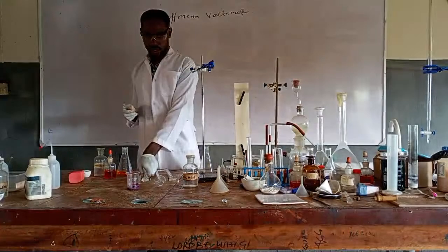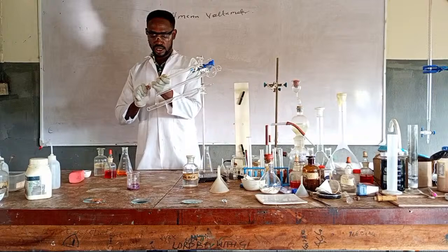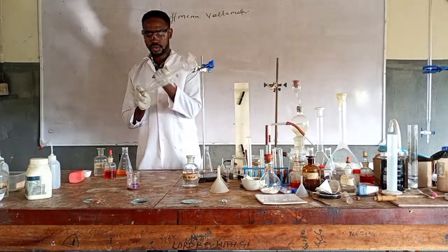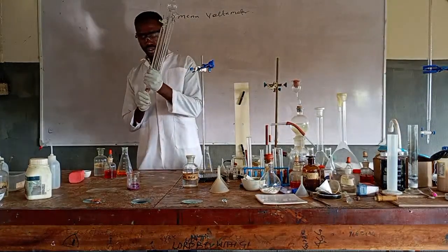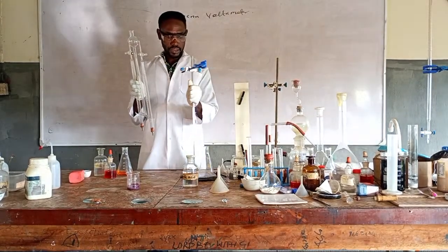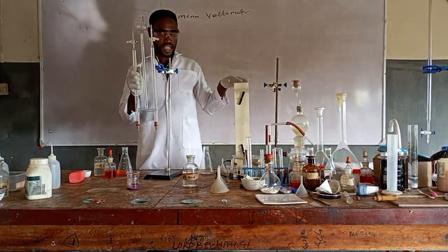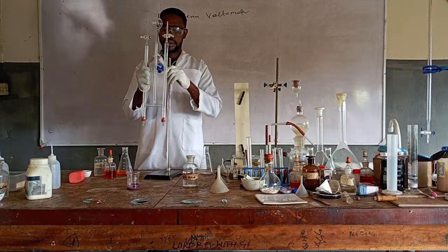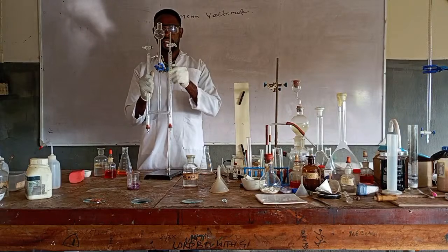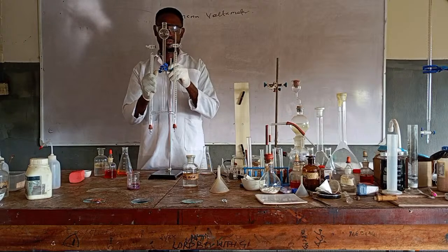So first, we will have to tighten this, closing each of the arms with our electrodes. Remember what I call these? Electrodes. Okay. Then I'll fix it here. There is a type where this one acts as the stand, but not this type. This one you can only hang with your little stand. I hope the camera is capturing the stage well.